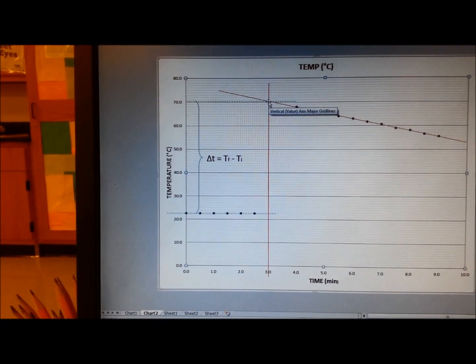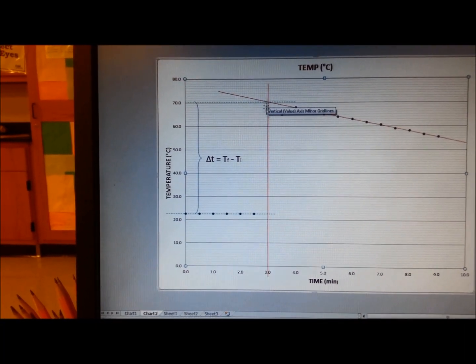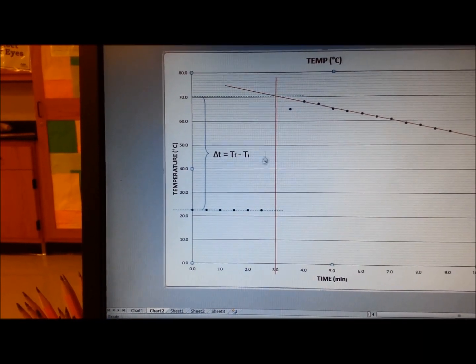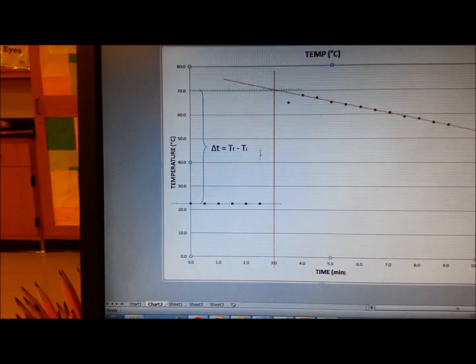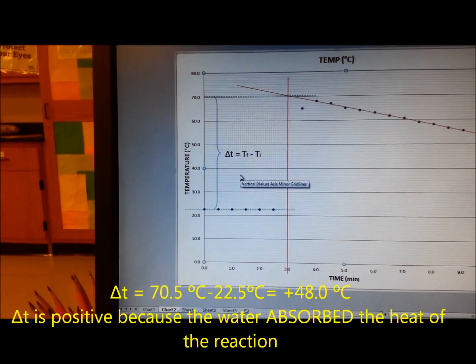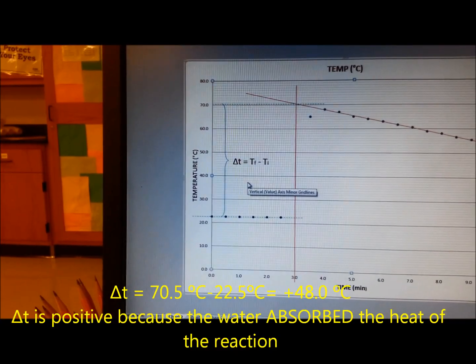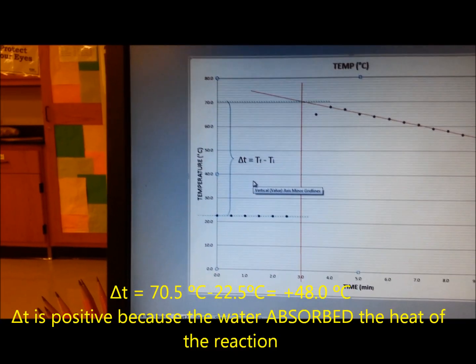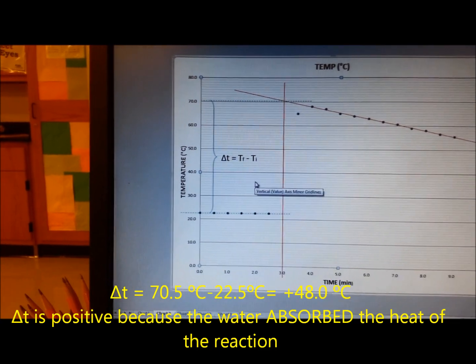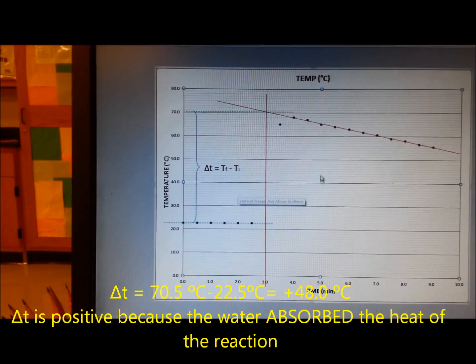With those two points — the maximum and the minimum temperature — we can get the delta T of the solution, which is the temperature increase of the copper sulfate solution. In this case, that is the temperature change in the water, and with that delta T we can calculate the amount of heat released.